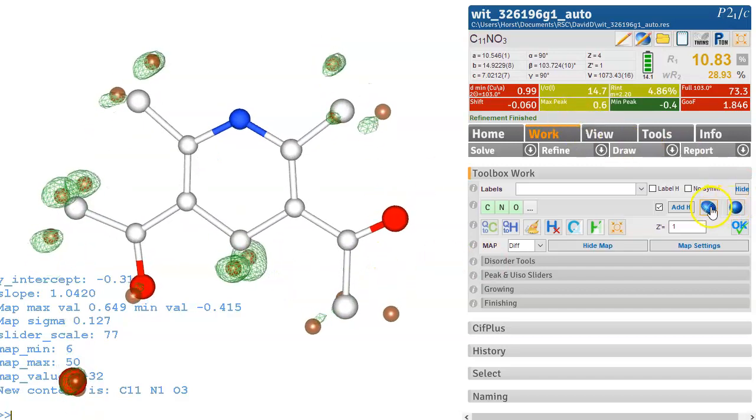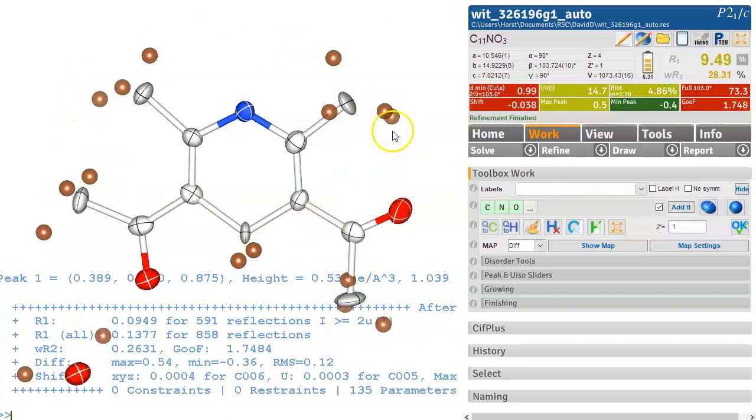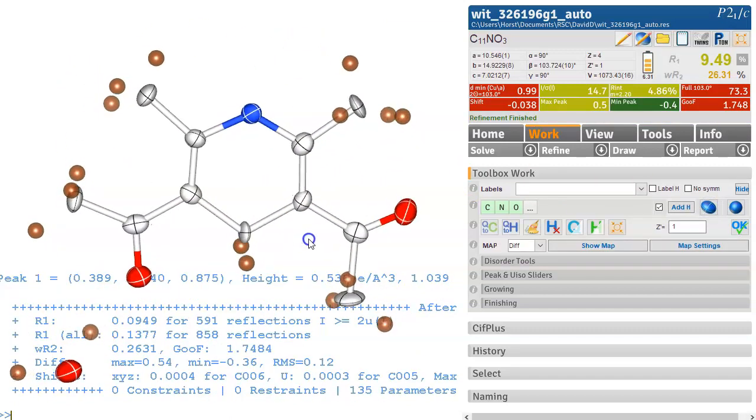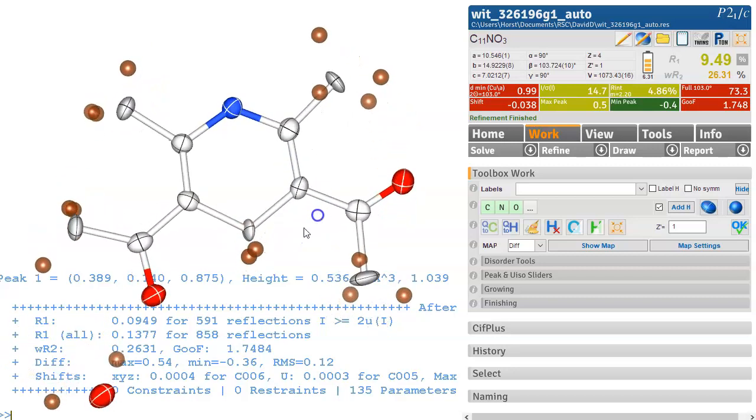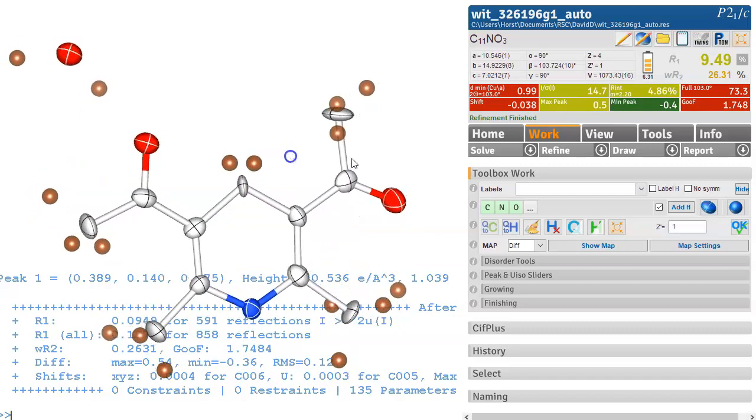Okay let's hit this rugby shape thing and that makes these atoms anisotropic and we can now really clearly see the hydrogen atoms. One thing that really intrigued me on the structure is it's quite clear that there are two hydrogens over here.